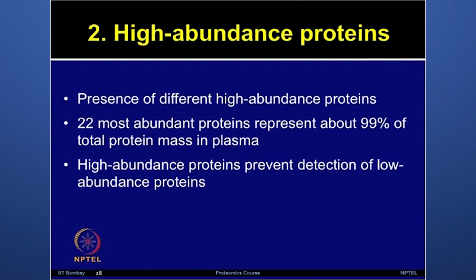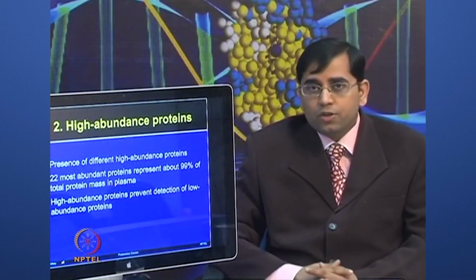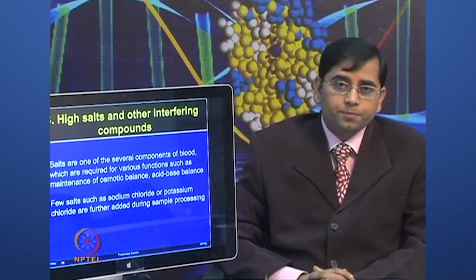So, how do we get rid of the high abundance proteins? I will describe some of the strategies which can be used to remove high abundance proteins in the next couple of slides, but first let us talk about the other challenging factors for serum or plasma analysis.